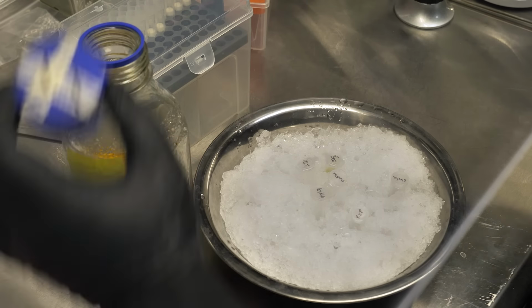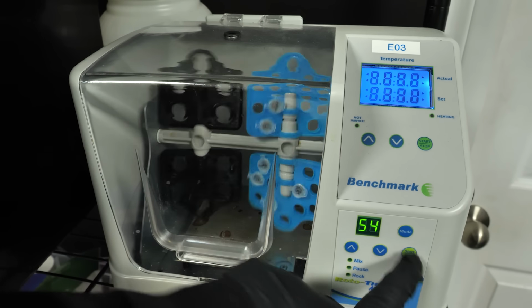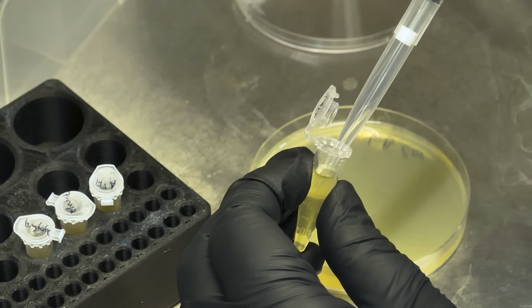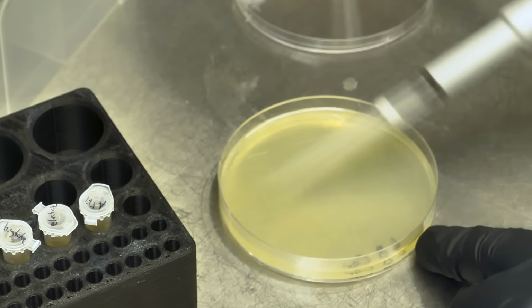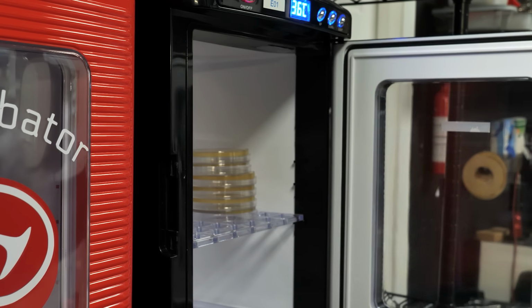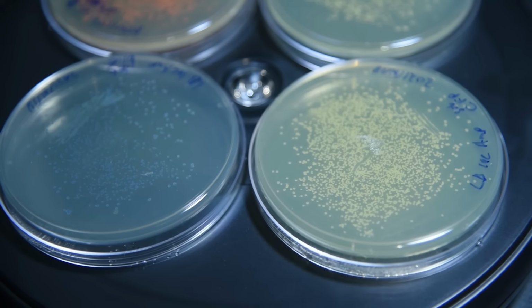To help them recover from this whole ordeal, we add 1 milliliter of LB and then let the tubes hang out in the incubator for an hour or two. Finally, 150 microliters of each solution can be spread out onto appropriate antibiotic plates. These are just left in the incubator to grow overnight. The next day, the plates should be covered in little colonies, and we can see what the DNA did.